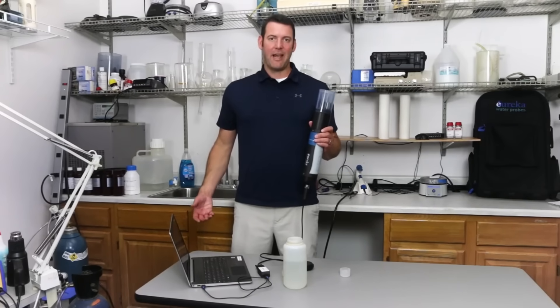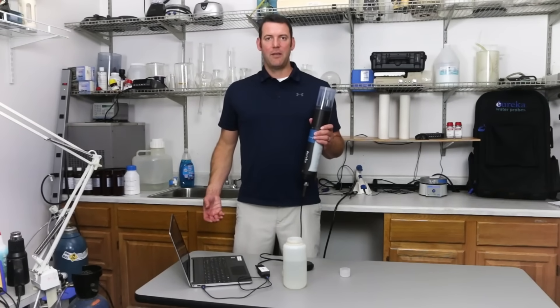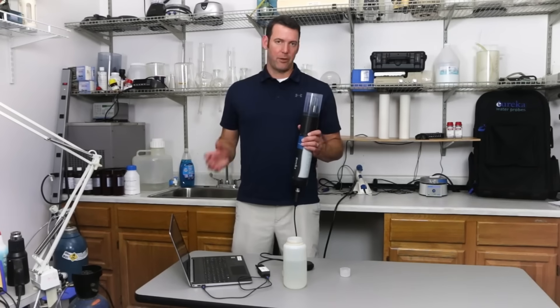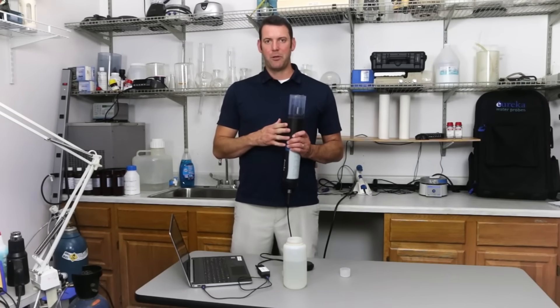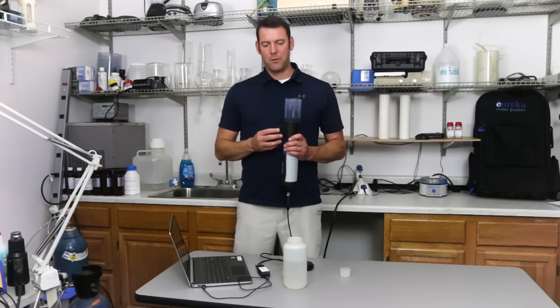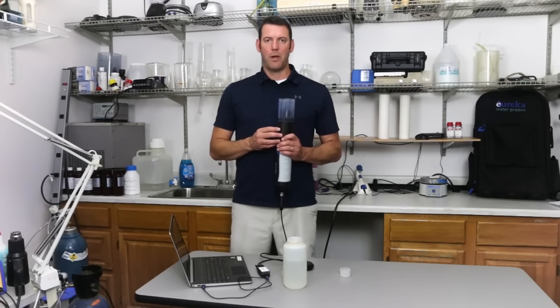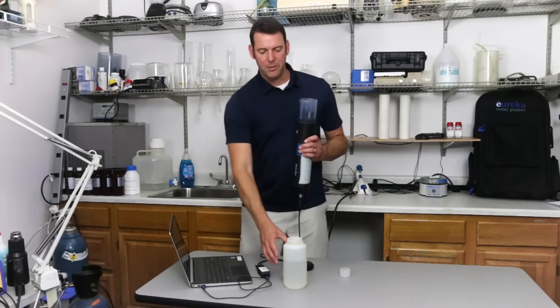To do your second calibration point, click continue on the screen and then do your rinsing process — first two times with your DI water, then two times with your solution. If you're doing zero NTU solution, or if you're just using DI water, that's fine as well. Then fill up the cup one inch above the top of the turbidity sensor.